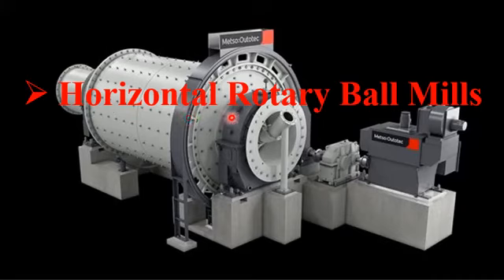So the balls used for crushing in the horizontal rotary ball mill apparatus depend on the nature of the bulk material which we want to convert into nanoparticles. Based on the bulk material, the most commonly used balls are pebbles, ceramics, or stainless steel balls.